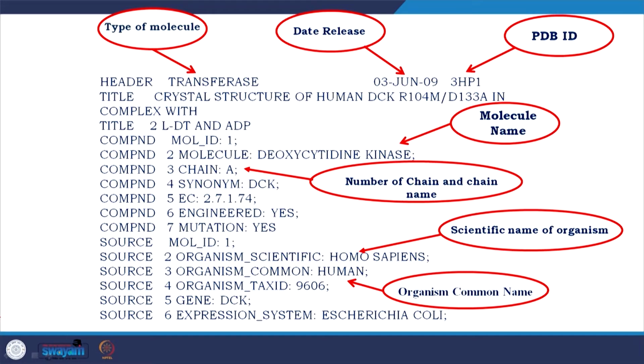That is one of the reasons a lot of people do not read the PDB file. Most people only get the coordinate information. Definitely coordinate information is important, but a PDB file provides you much more than that. What we are going to take a look at: this is the start of the PDB file, and you see so many things.